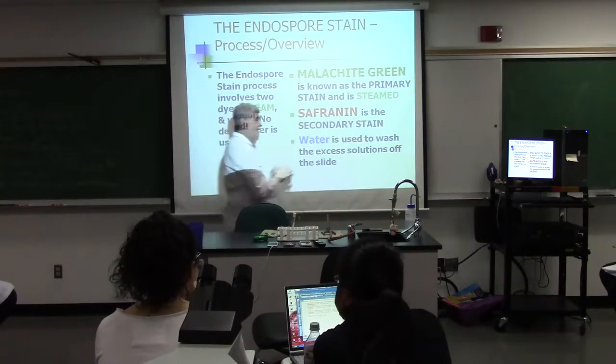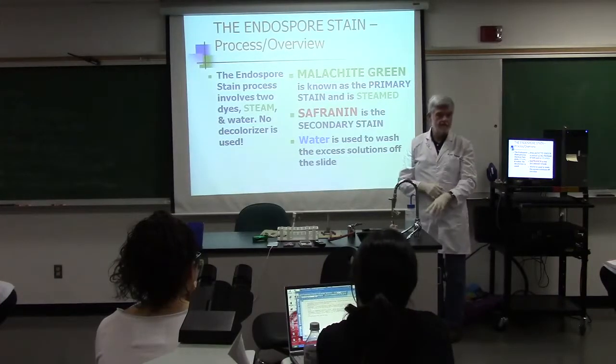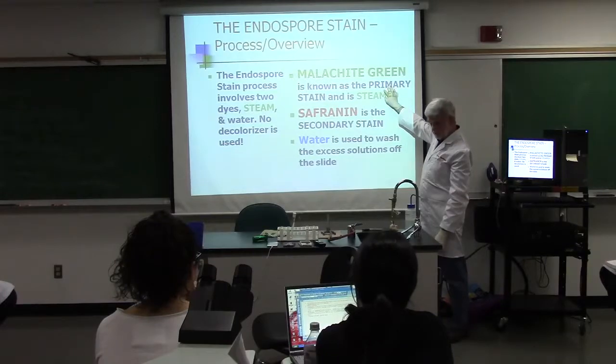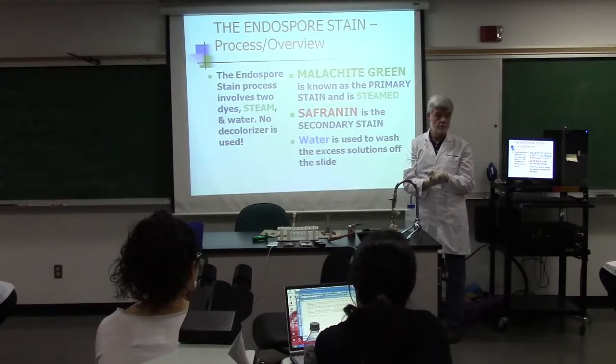So, I'm seeing a lot of people being chintzy with this. Put a lot, get it off. That's it. On this one, be careful with this heating thing. If you get it too hot, too quick, it's going to bind to everything. And all green is like all hot pink, always wrong.